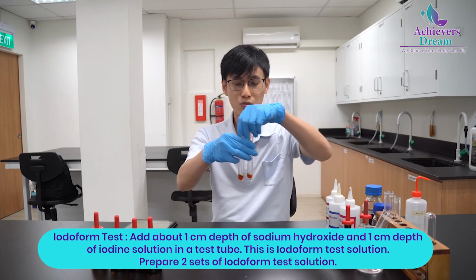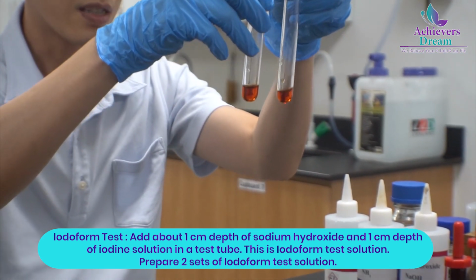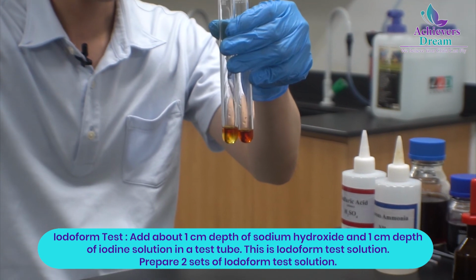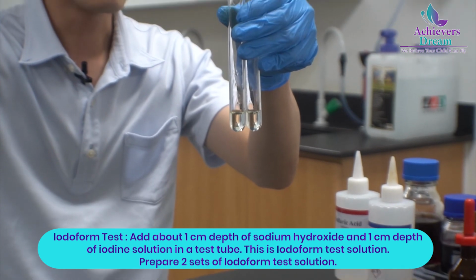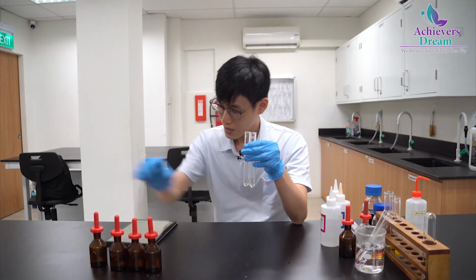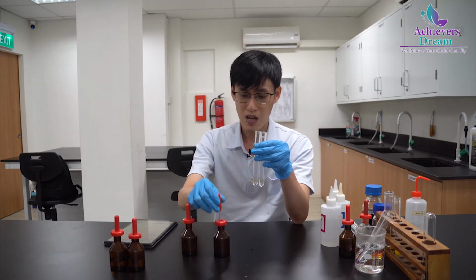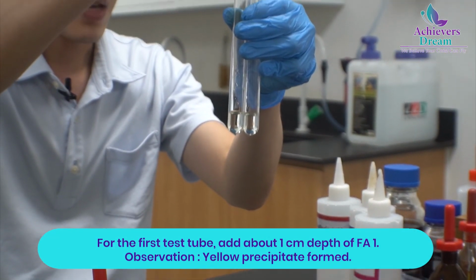So here I have 2 solutions which I have filled with aqueous iodine. You can see the brown color of the iodine. I will then add sodium hydroxide to give our alkaline aqueous iodine. As you can see, the brown color of the iodine is decolorizing. That is normal. After which, we will add Fa1 and Fa4 to our alkaline aqueous iodine. So I will add Fa1 to the test tube on my left.